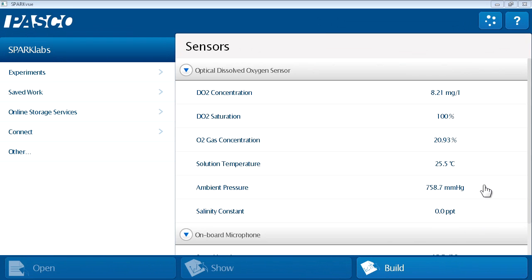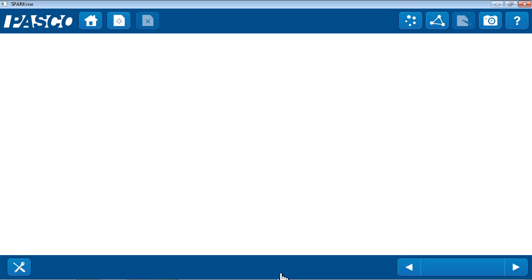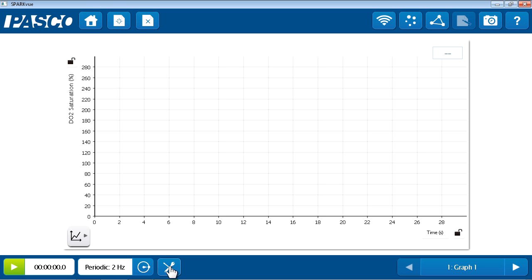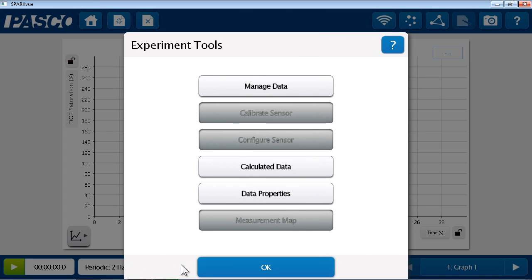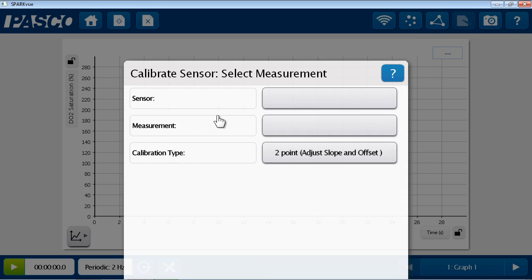To calibrate the Optical Dissolved Oxygen Sensor, we first need to open an experiment file or create one. I'll do this by using the Show Path and entering the Experiment Tools. To set a salinity constant or to replace a sensor cap, use the Configure Sensor menu. To calibrate the sensor, proceed to Calibrate Sensor.